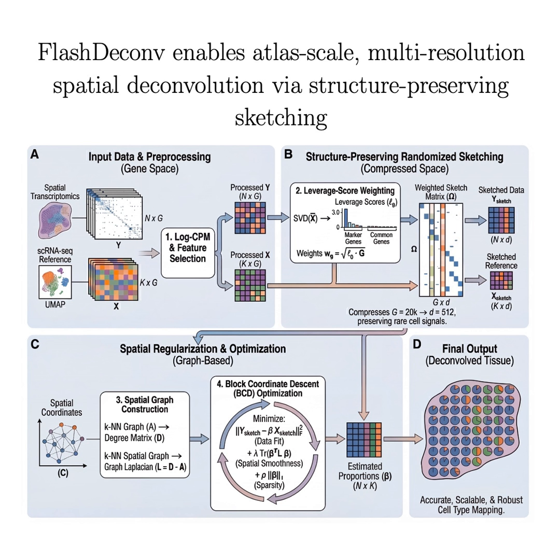So we have the what and the why. Now, for the big question, the how. How did FlashDeconv take this mathematical insight and build a whole framework that not only preserves these signals, but can scale up to analyze millions of spots on a regular computer? This required a complete re-engineering of the whole pipeline, and it's founded on 3 key computational choices that all prioritize linear scalability.